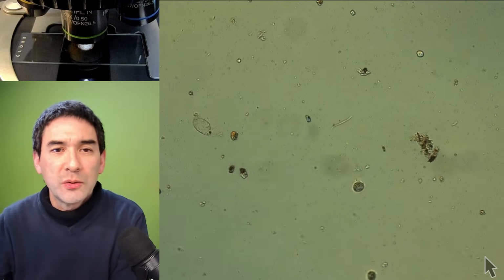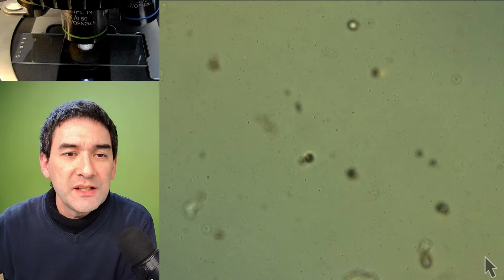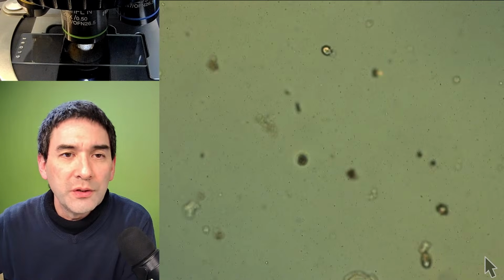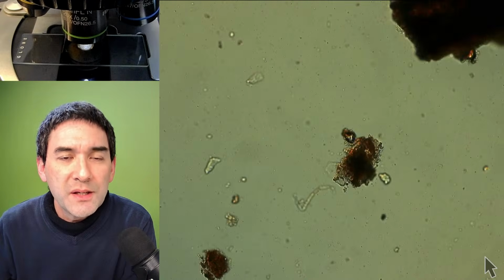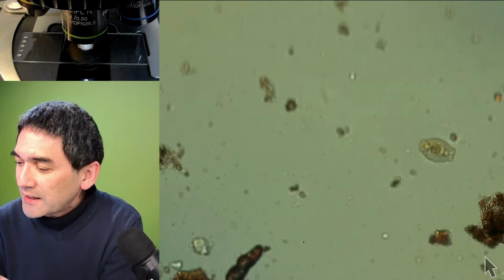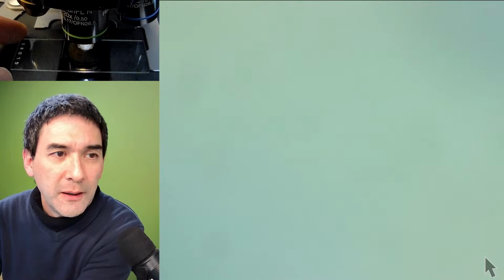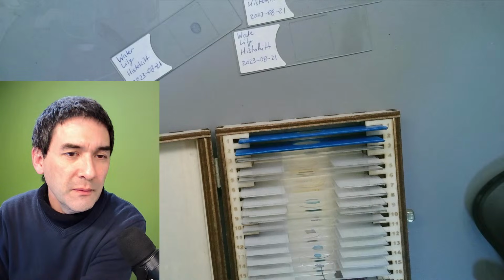We occasionally like to explore things. However, those slides, even though there is some nice, interesting movement going on here, don't always look as pretty as some other ones, especially plant cross sections and so on. For this reason, I decided, okay, let's have a look at a few of my other favorite slides, and then take it from there.